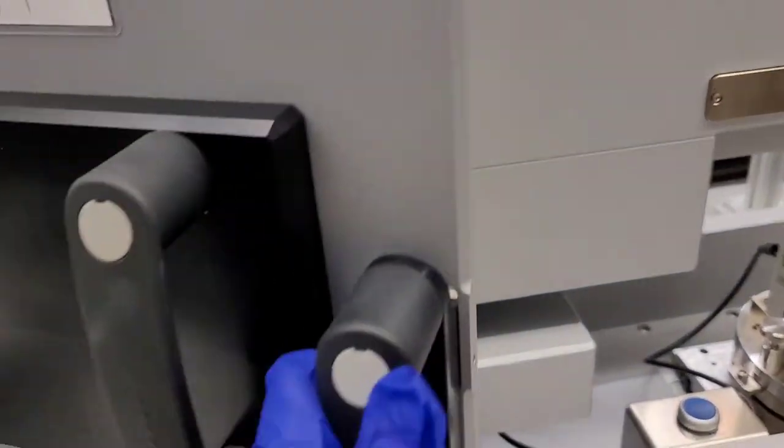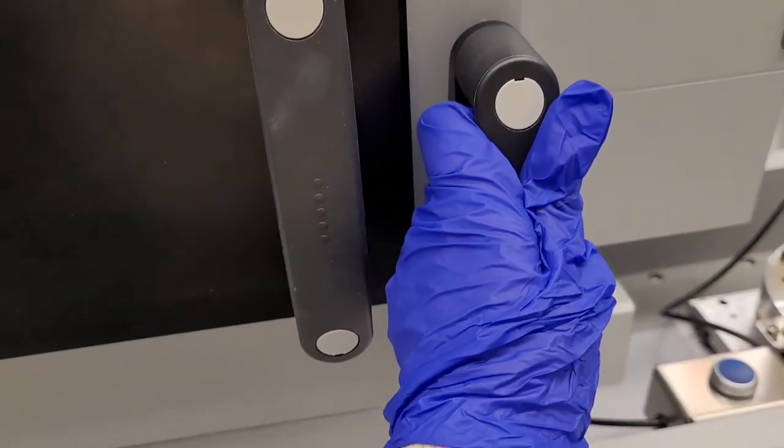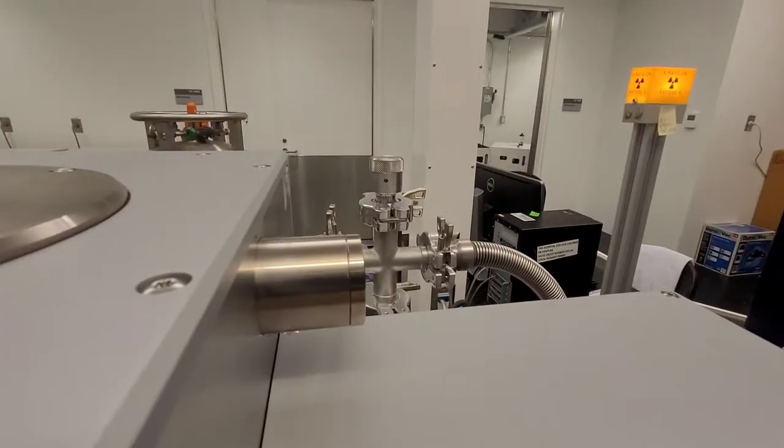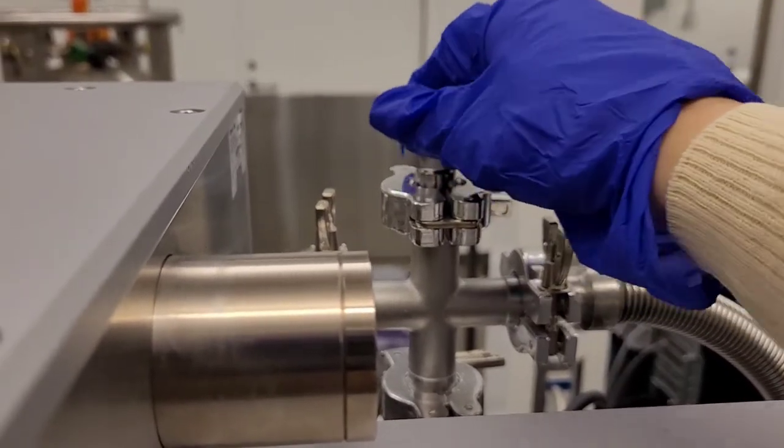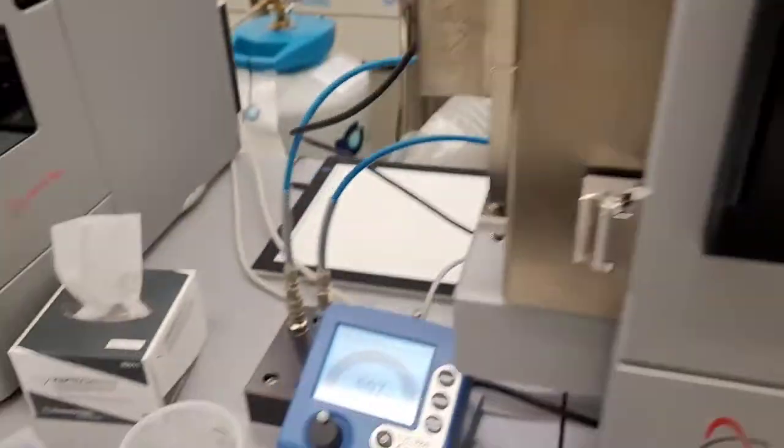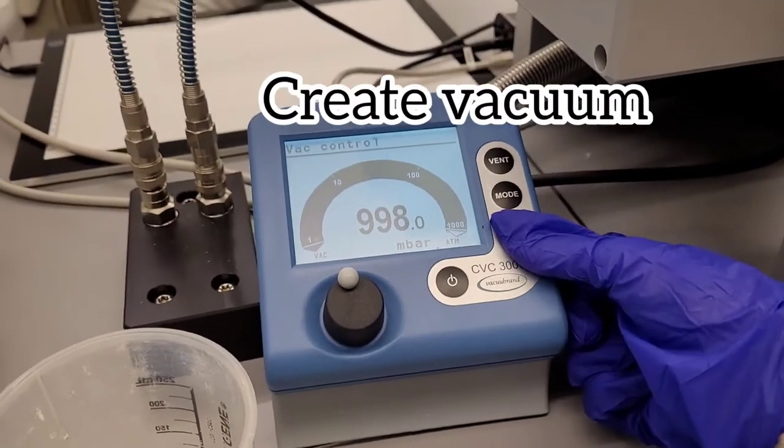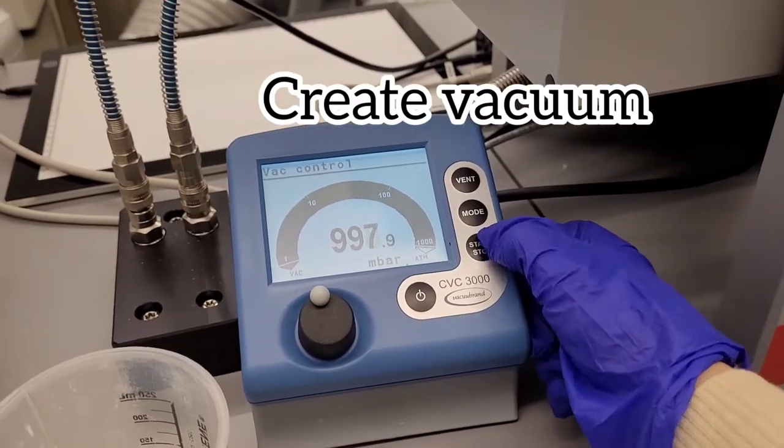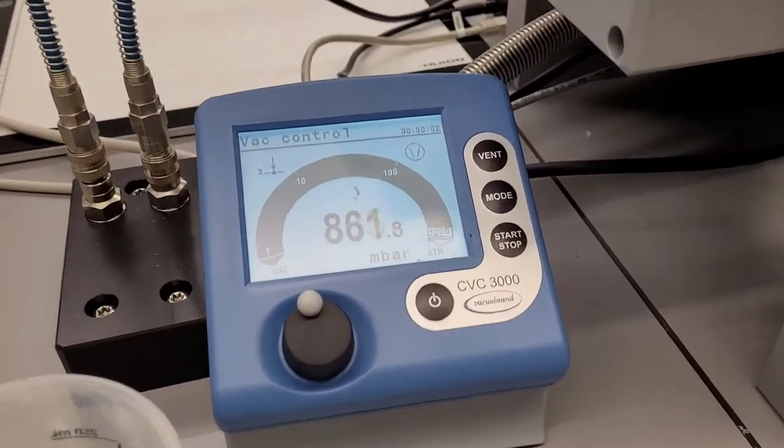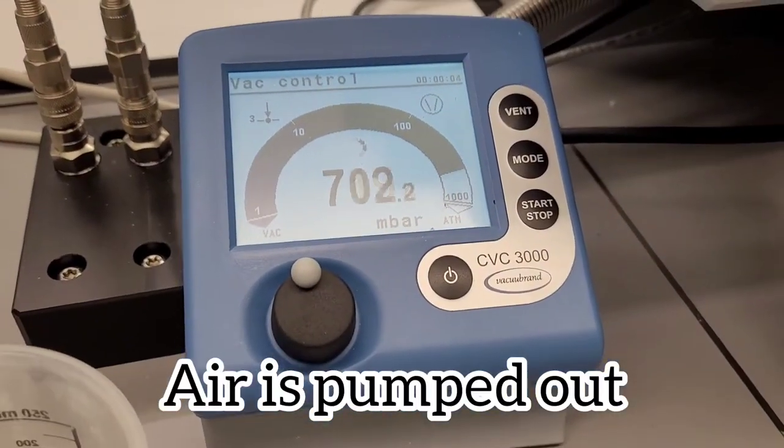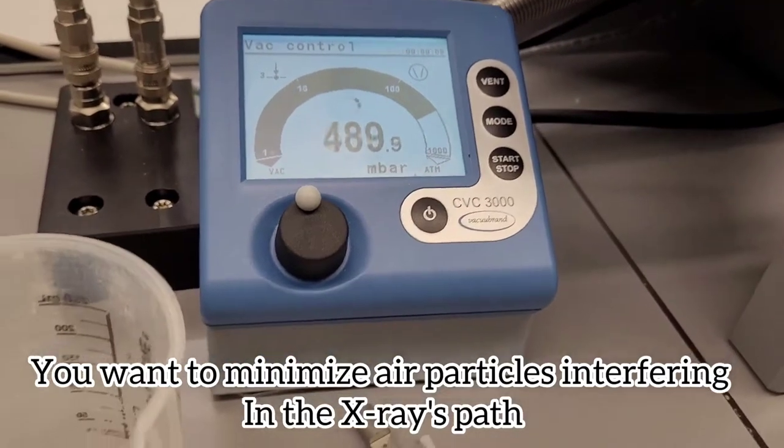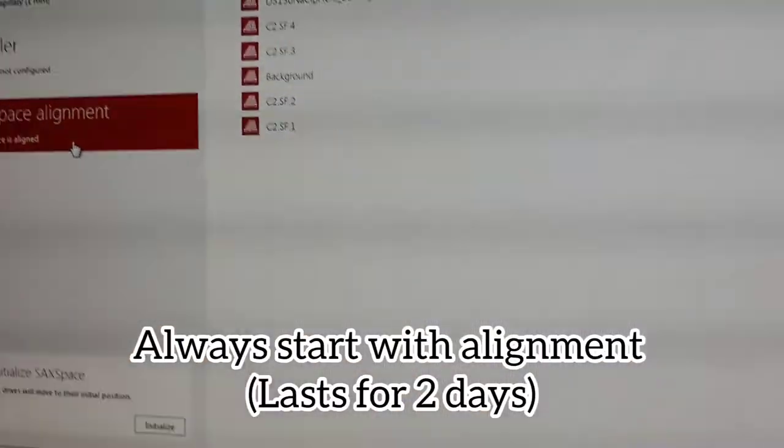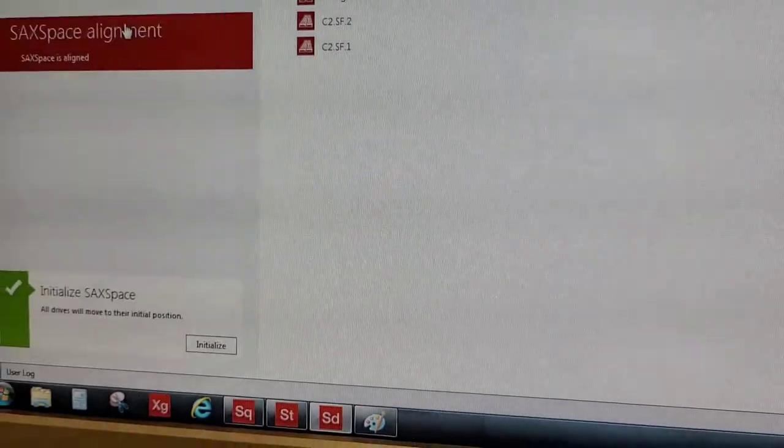Then close the door and you want to create a vacuum inside. So first you close this little thing and then you press the button that will pump air outside of the box where your sample is in it. This is because you don't want air molecules to be on the way of the x-ray beam.